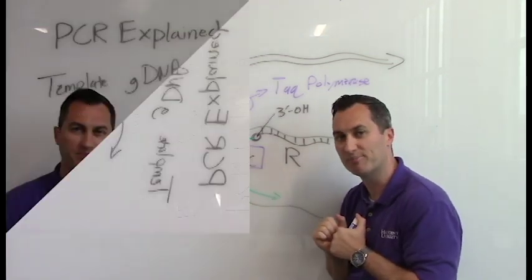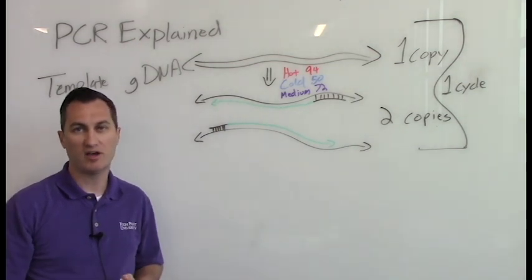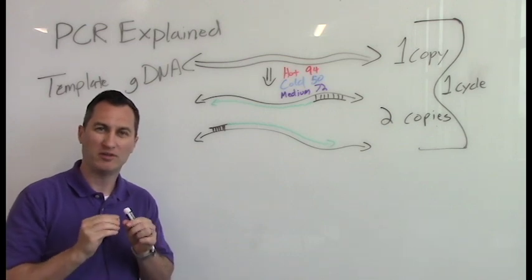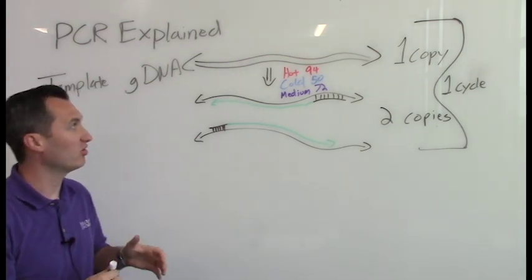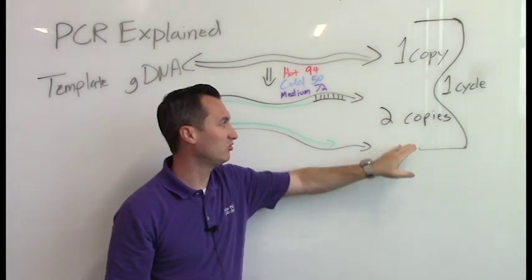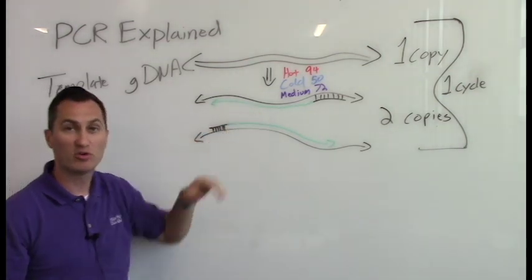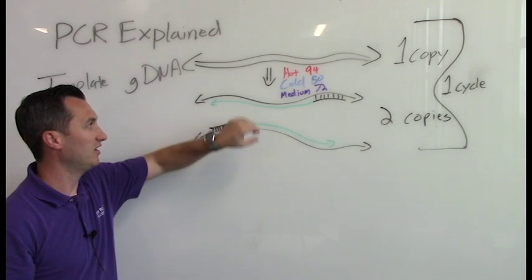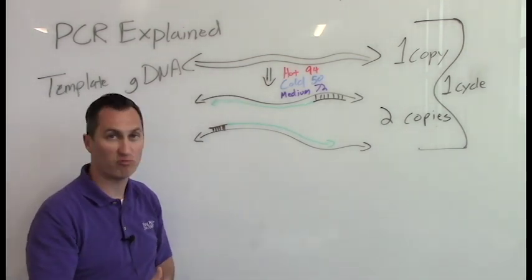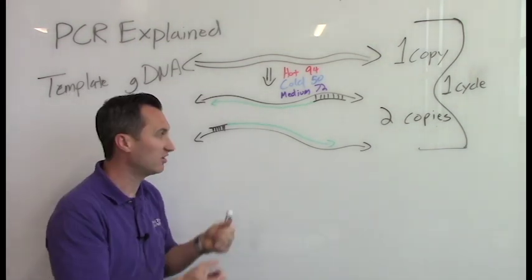of that template chromosome. Okay, what I've just described is one complete cycle of PCR with steps hot, cold, and medium temperatures in that little fancy oven that's driving this reaction. So when you've completed that, you've gone effectively from 1 copy to 2 copies of your particular target. Okay? And you can see that here. In the green, I'm showing the new DNA that's been created, and in the black, the original template DNA. Okay? All we have to do now is run another cycle of this reaction. All of our ingredients are still in the same mix, and we can continue from there.